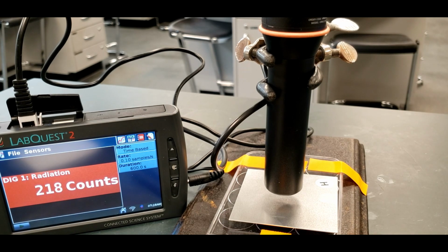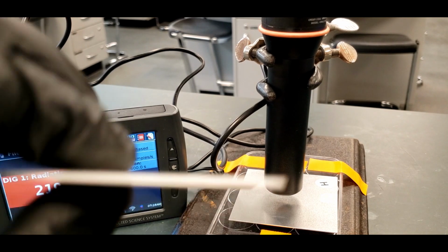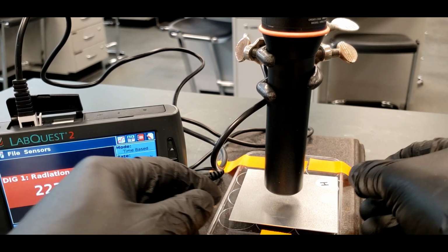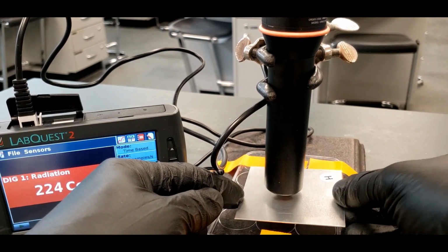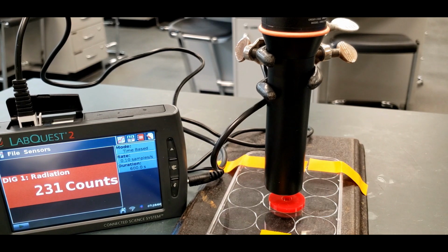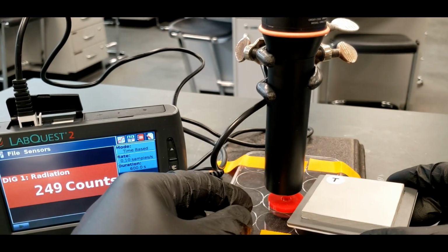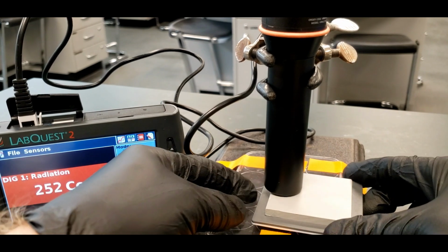Here is aluminum, and it's 0.025 inches, so about the same thickness as this. You can see that the count is pretty low. It's probably close to background radiation. And then it comes back, and then we'll put in the lead, if I can fit it under here.